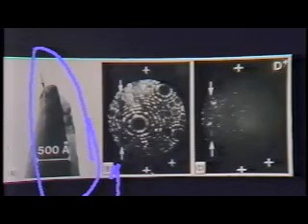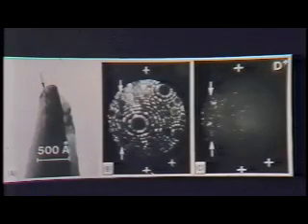There's an image of a grain boundary, and here's an image time-gated for deuterium, because what we were interested in doing in this case is looking at the diffusion of deuterium damage trapped at grain boundaries in crystal lattices, something that metallurgists are beginning to use now quite extensively. This particular technique is a nice complement to the electron microscope because it extends its analytic capability beyond the range that electron microscopes nominally work at now.